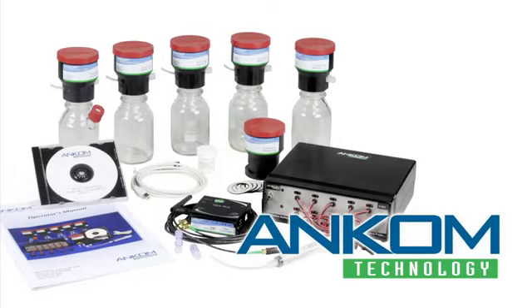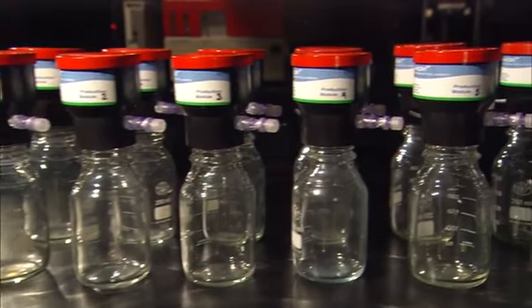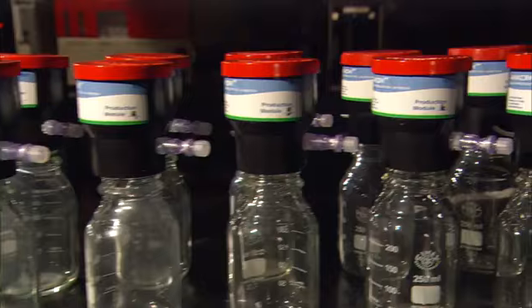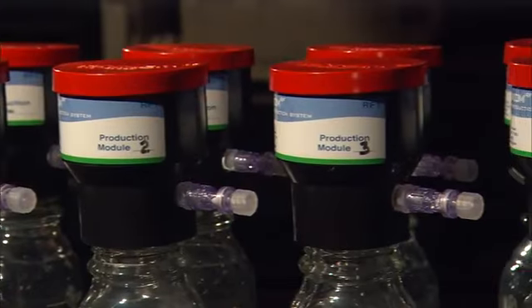The ANKOM RF gas production system provides an easy-to-use tool for monitoring and measuring evolved gases during anaerobic fermentation or aerobic metabolism. Designed to support studies in rumen digestion, the RF system is also used to study human digestion, yeast activity, dough rising power, biomass to energy development, biodegradability, wastewater treatment, and more.